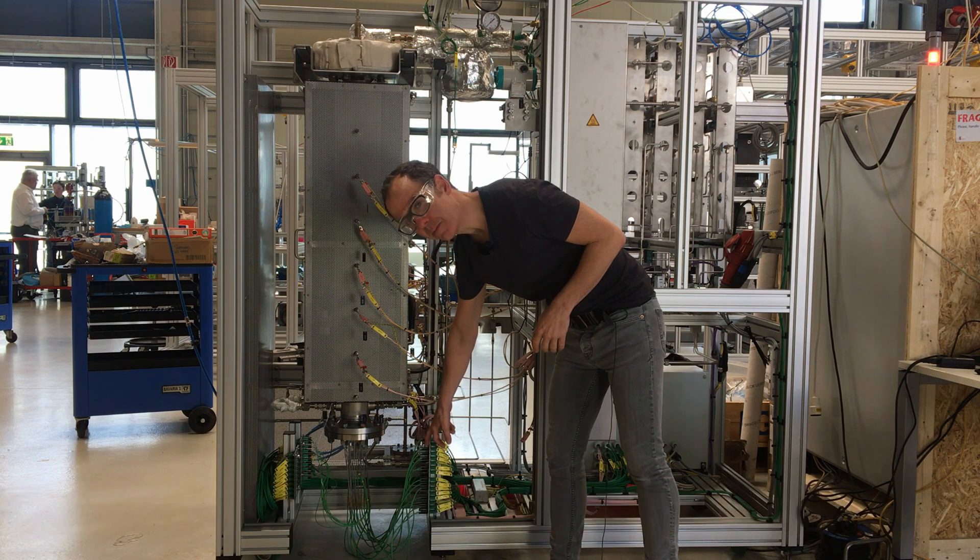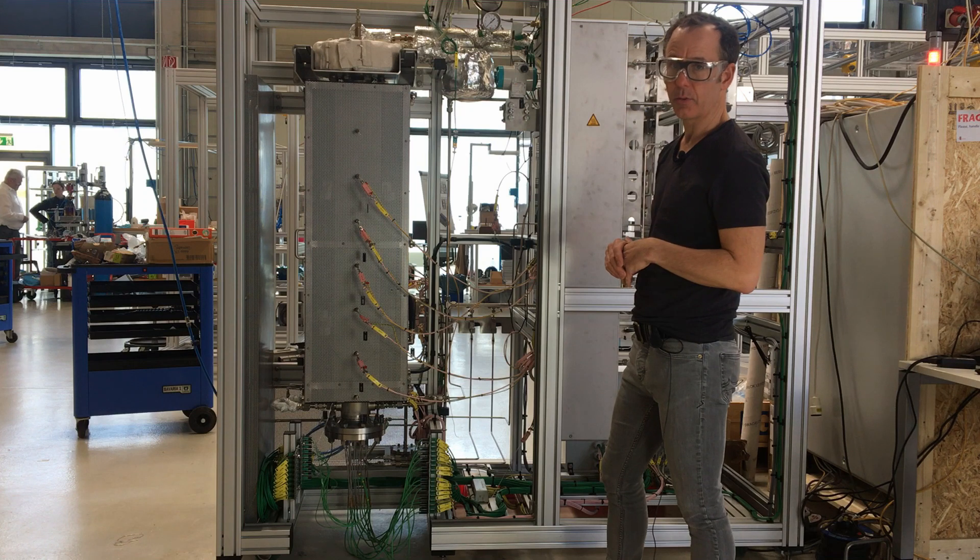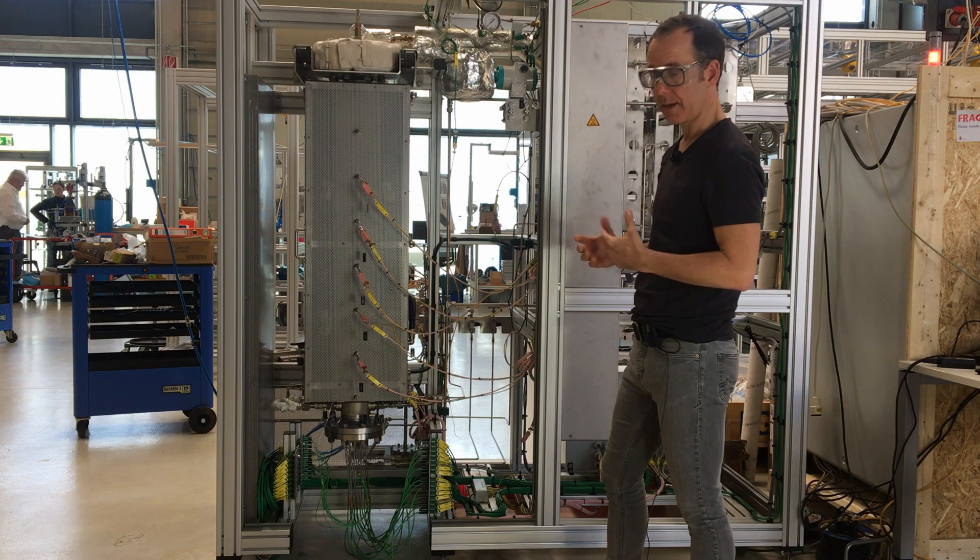We're working with type K thermocouples here, and we also have a really nice software solution so that you can actually see these on the screen easily. I'll show you that in a second.